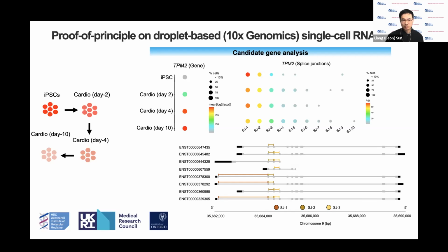The other question I have is that we actually use several RNA splicing software like rMATS and LeafCutter and DEXSeq also. So for your current tools, you said that basically we can use output from those, or any data format from rMATS, and also any other software formats, we can also use in your software.